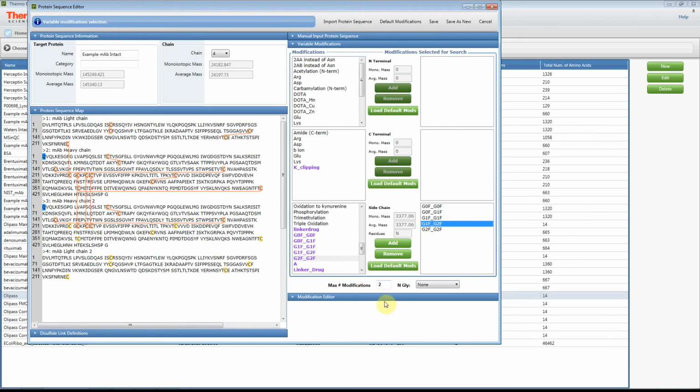So if you're doing peptide mapping, you want to use one of these databases, or just be aware that whenever you add a glycan like this as a variable modification, you should lower the confidence score to probably 0, so you can then see the actual match, because it will not assign the glycan fragments unless it's from the database. Once you've done all this, now you have the correct mass here in your target protein sequence for your intact molecule.